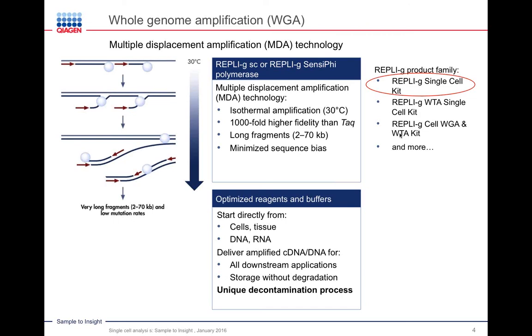be first starting potentially with a degenerate oligonucleotide, or perhaps you would be using a primer extension for preamplification, and this would all be methods that you would use to get more DNA for doing your downstream next-gen sequencing. And all of those would be based on the Taq polymerase. Taq polymerase has a limit of about 3 kilobases for making PCR strands. It's known to have a large number of errors and an amplification bias because you're constantly cycling through high temperatures and low temperatures where you're annealing the DNA template and priming, and it has known issues with secondary structures because of this constant priming and amplification.